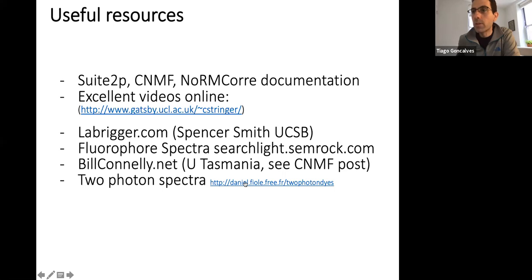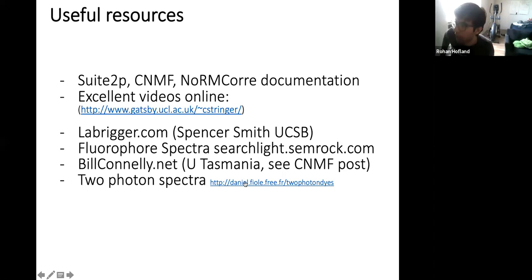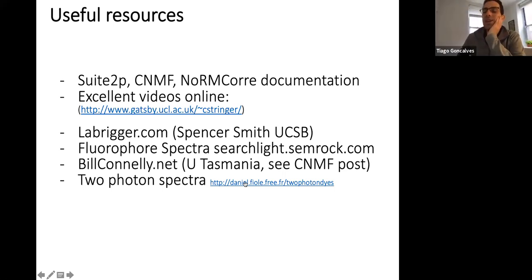Other questions? Just out of curiosity, is it possible to have a mouse line with a fluorescent soma while you're doing in vivo recording, so you can identify cells without? Oh yeah, that's an excellent question. And this is actually very useful for different things.